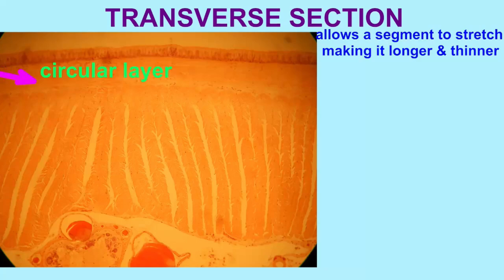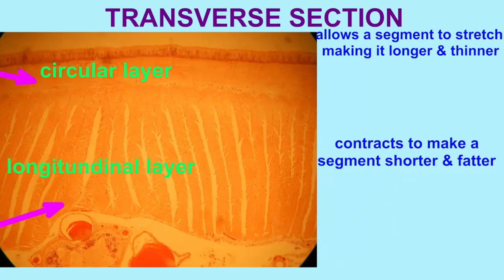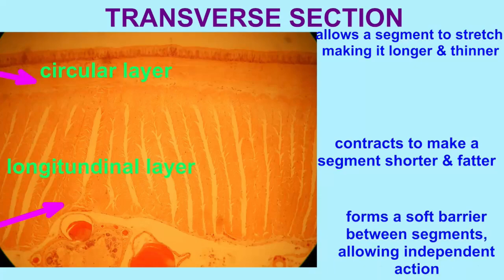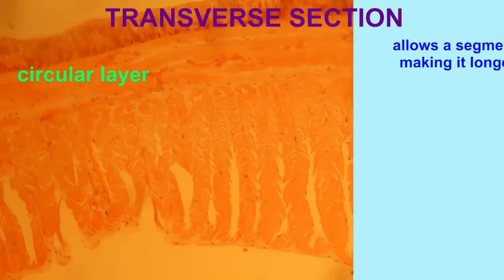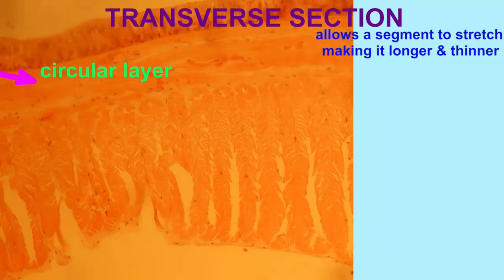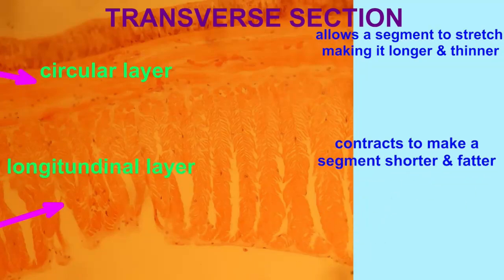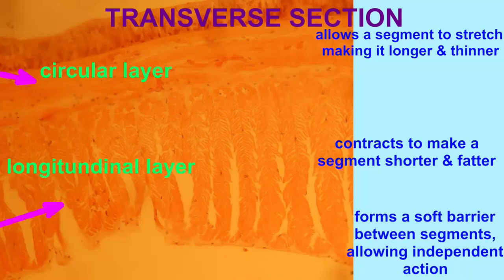In transverse sections across the earthworm's body, creating a front and a back, one can see the circular muscles running around a segment and a section through the longitudinal layer. Note that these two layers look different in the longitudinal and transverse sections.